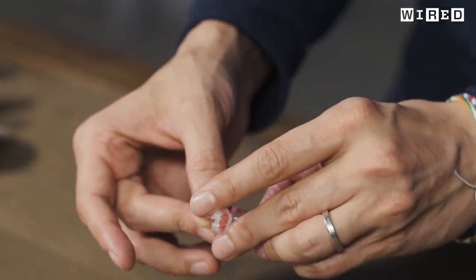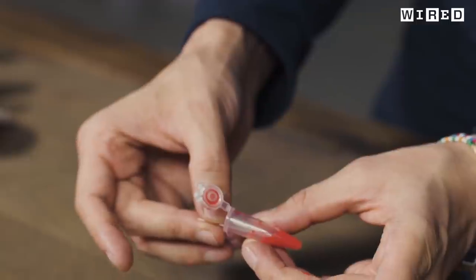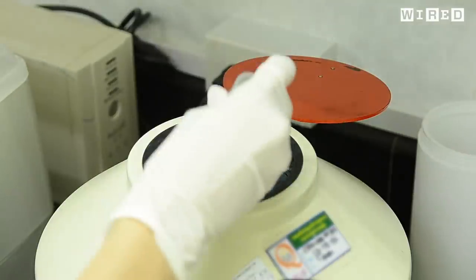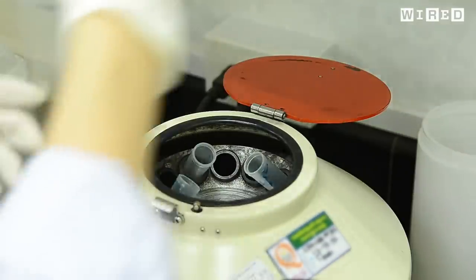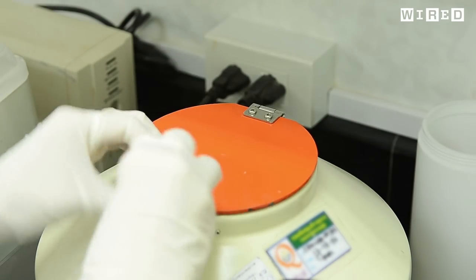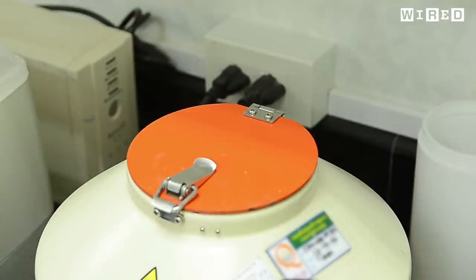Manu Prakash is a bioengineer at Stanford who spends a lot of time thinking about how to make science affordable and accessible. To him, frugal science is really designing with constraints in mind — when we talk about bringing tools to the masses, we truly mean billions of people. Commercial centrifuges are heavy, require electricity, and can cost thousands of dollars, making them unaffordable or unusable in many parts of the world.